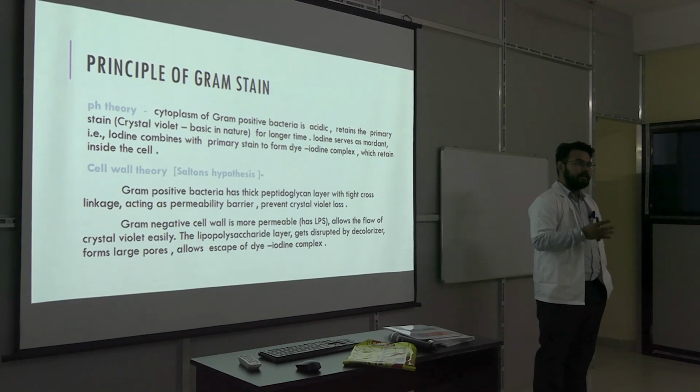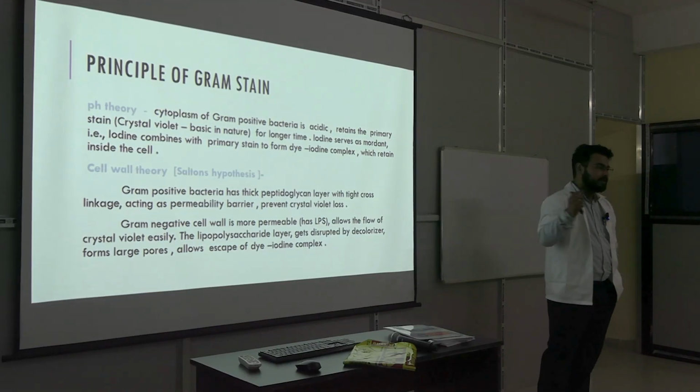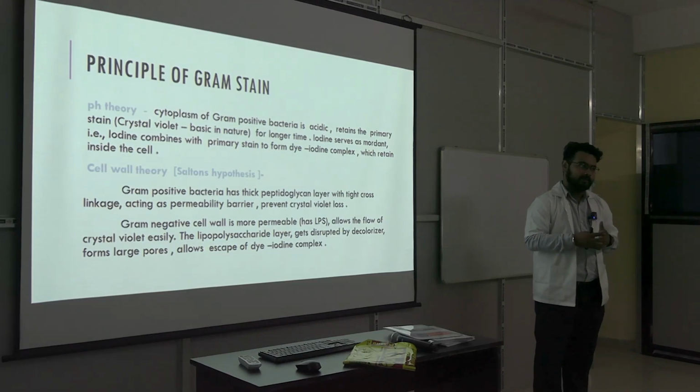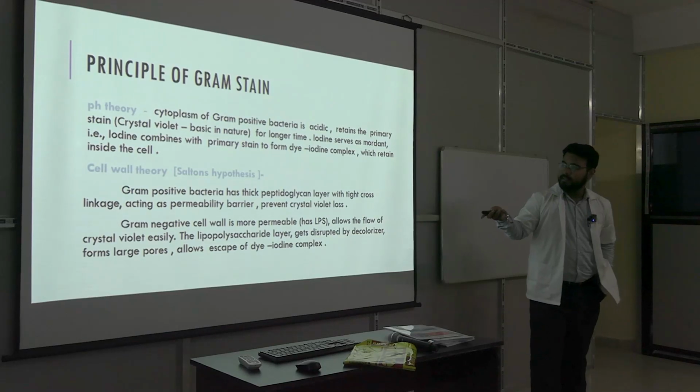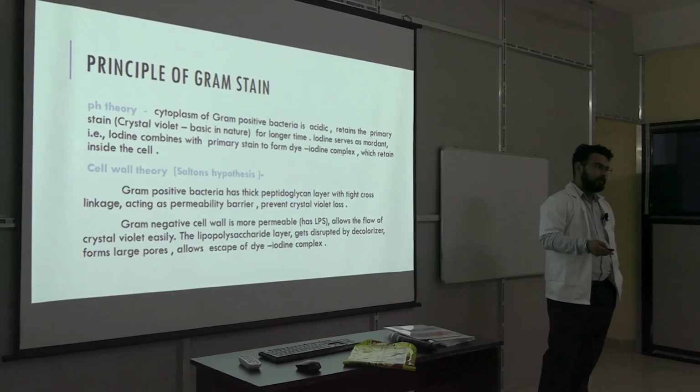Thicker peptidoglycan layer in case of gram positive bacteria, and gram negative bacteria have a thinner peptidoglycan layer. Gram positive bacteria also have strong cross linkages between the peptidoglycan layers, as well as gram negative bacteria have a lipopolysaccharide LPS layer.